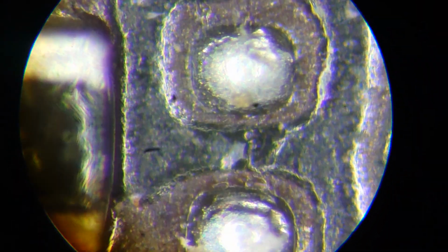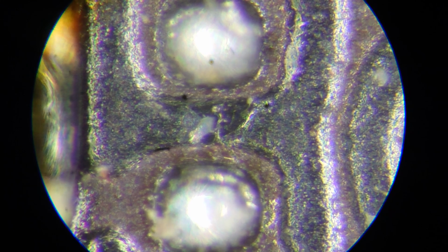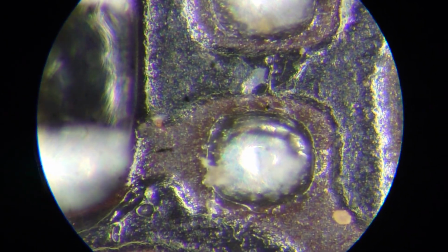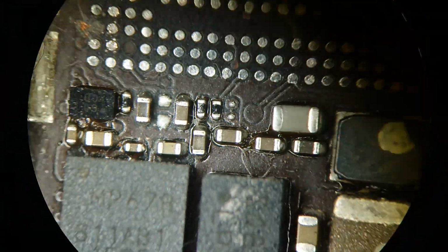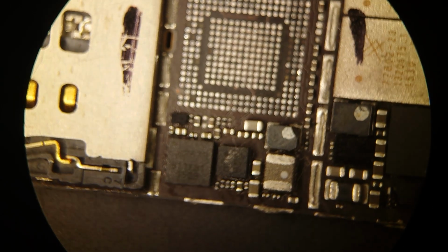So it's not easy to spot where we are. I've spotted it. So we can see now the top of this solder part and the base of the board. If you move to this little smallest part here, you can still have focus either on the top of the smallest part or on the board. So, to be frank, with such a strong objective, not many objects on the board could be used easily. Okay, let's move a bit further.